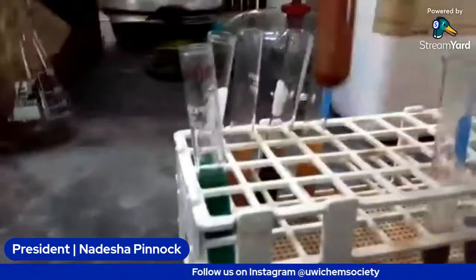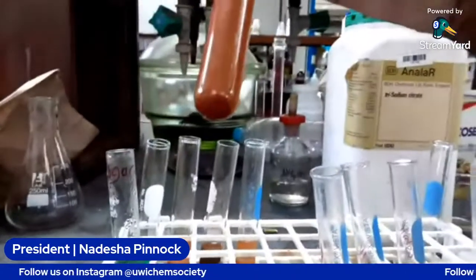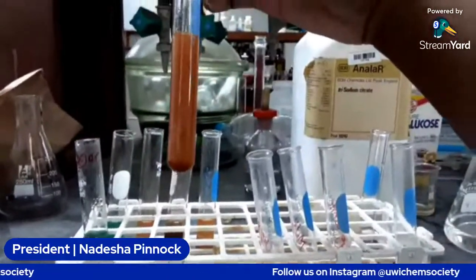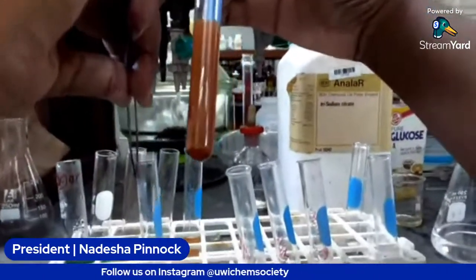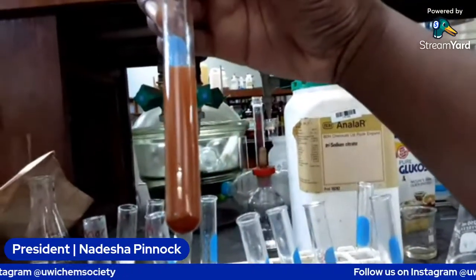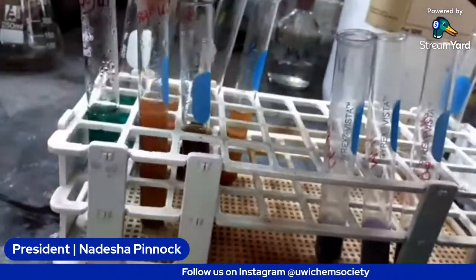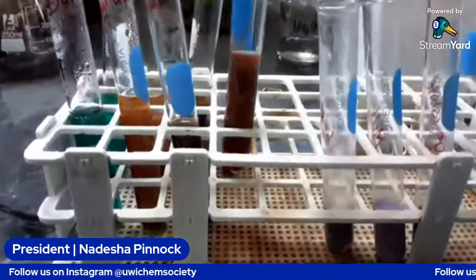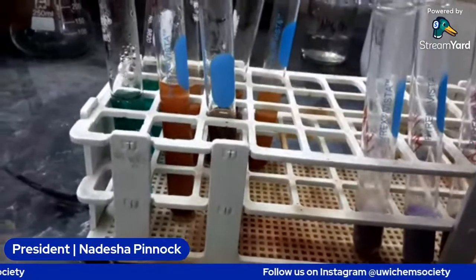This is the syrup. So this one is the orange one with so much precipitate at the bottom. And we all know that syrup has glucose, and I'm pretty sure it has a lot of fructose. So this is the fructose, so it's matching what we had before here.